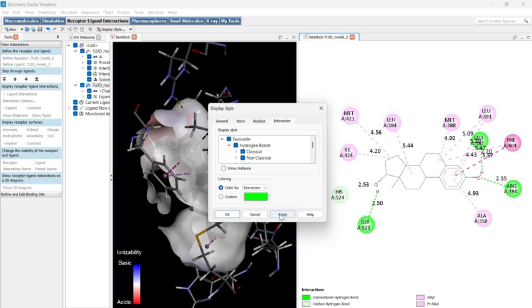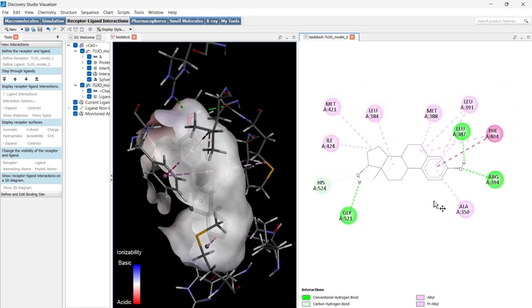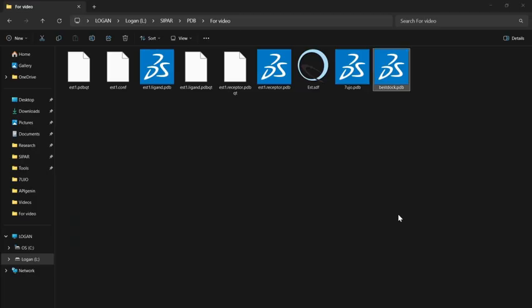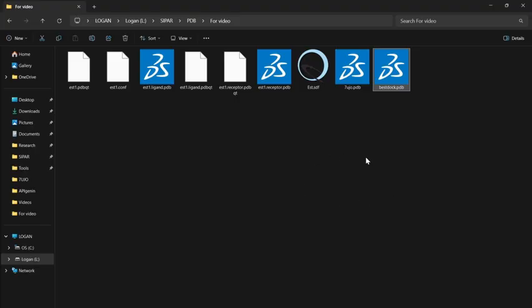So, yeah, okay. Here you can see that our molecule has 3 conventional hydrogen bonds. Okay, that's great. And other pi-pi interactions, pi-pi T-shaped overlap, and other hydrophobic interactions. Okay, you docked the molecule using Chimera and AutoDock Vina. Here, if you just wish to get the best dock pose, just go here and this one, the name and the PDB codified. This includes all the poses of the ligand.